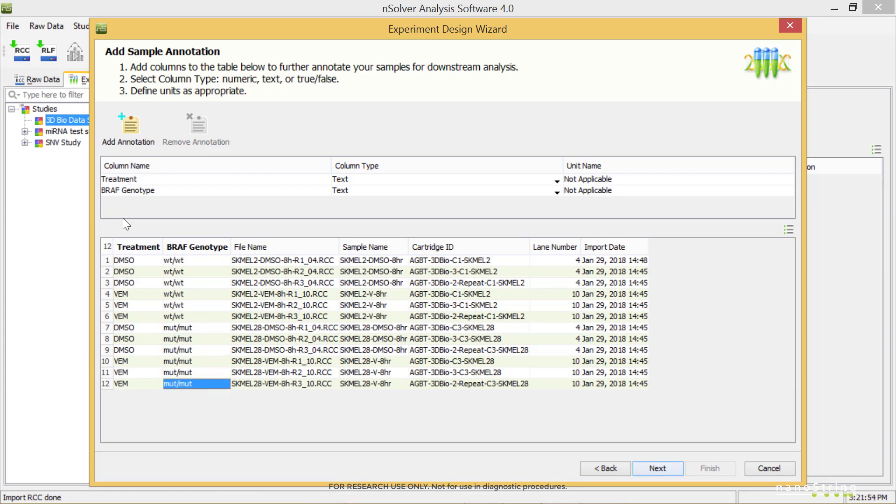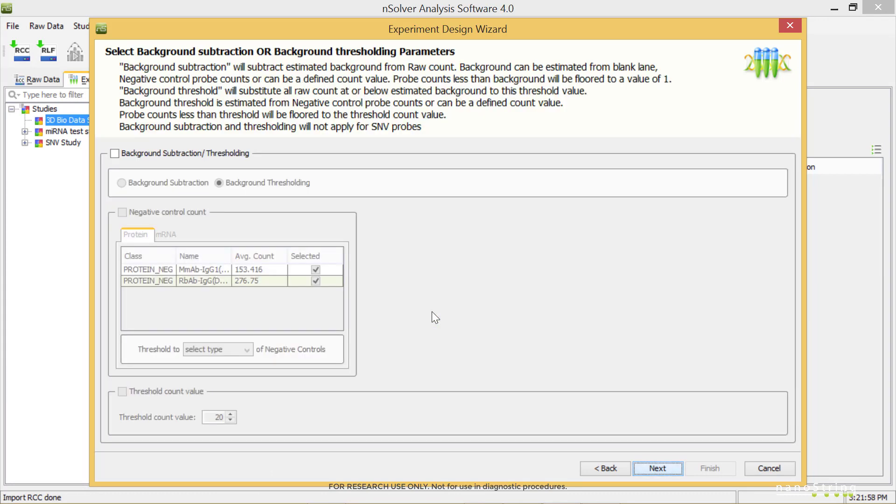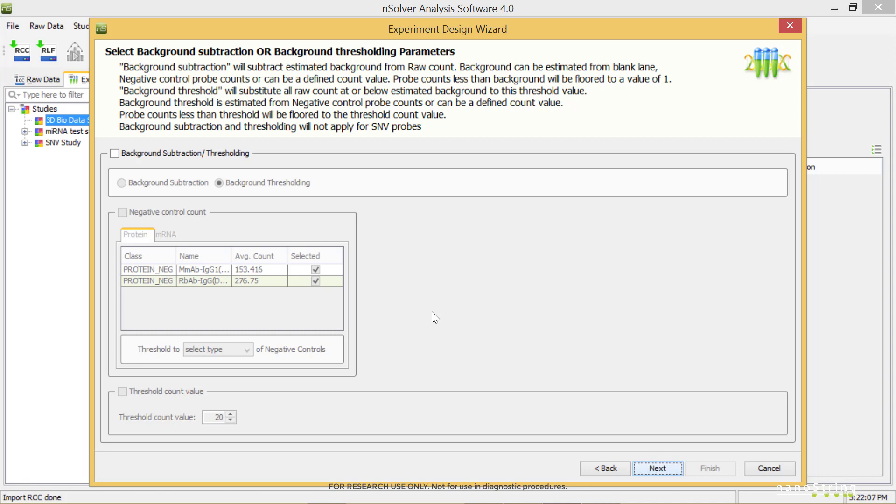Background noise can be filtered out using subtraction or thresholding, and this is optional. By default, background correction will be checked off, and in most cases you won't need to deviate from this. If you are performing background correction on your data, thresholding is recommended for most analyte types. In this example, we'll leave background correction off.